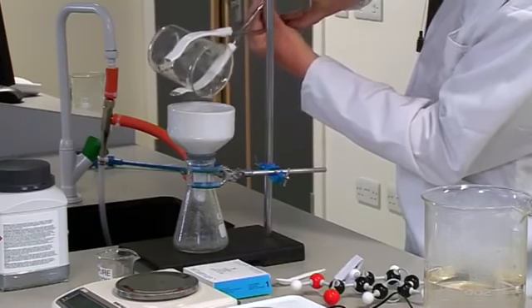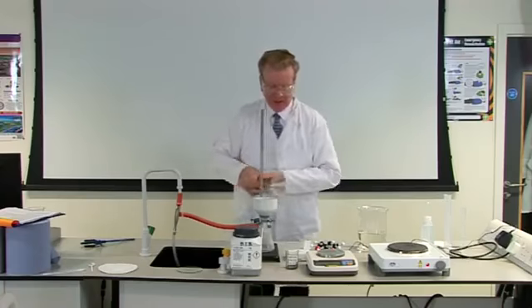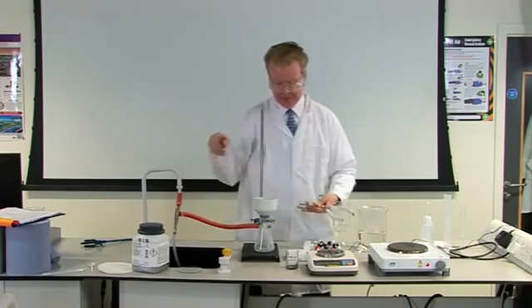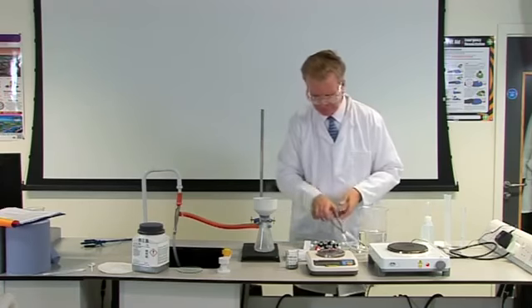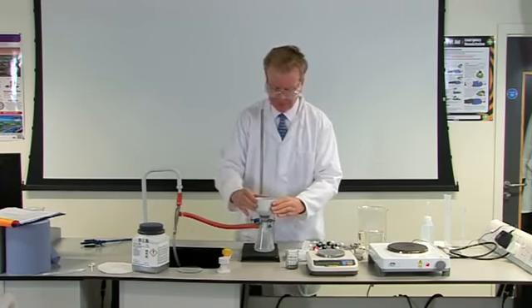If crystals form on the filter paper, add a small amount of boiling water to dissolve them so that they pass through the filter paper. The hot, almost saturated solution is now filtered in order to remove any insoluble impurities. This filtration must be done quickly to prevent crystallization during the filtration process.